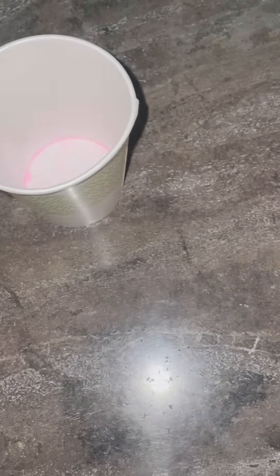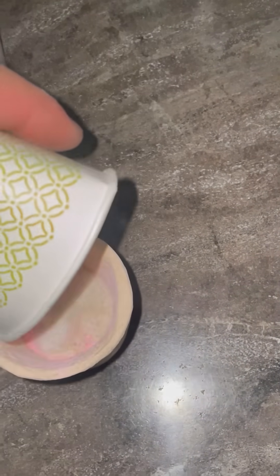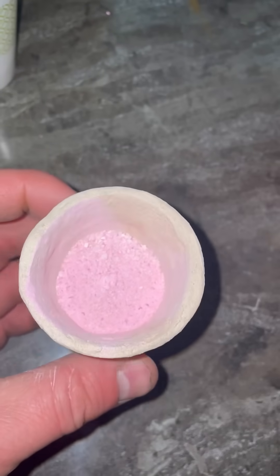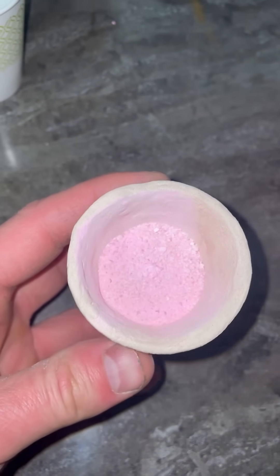Let's pour it off, pour it back to mix it. It looks pretty good, nice and pink. Let's go put it in the furnace and see what happens.